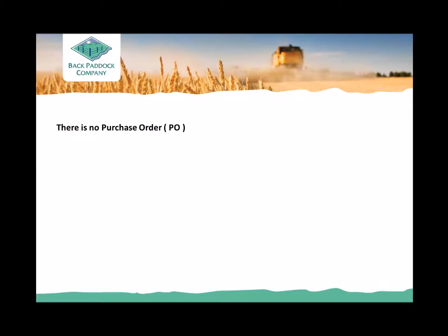The first one is there may not be a purchase order. And that just means that a purchase order was not pre-logged in your SoilMate program. The solution for that is to log the sample into SoilMate and click Save and then import your results as normal.